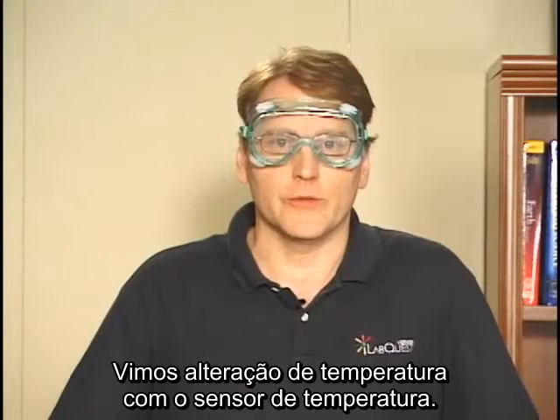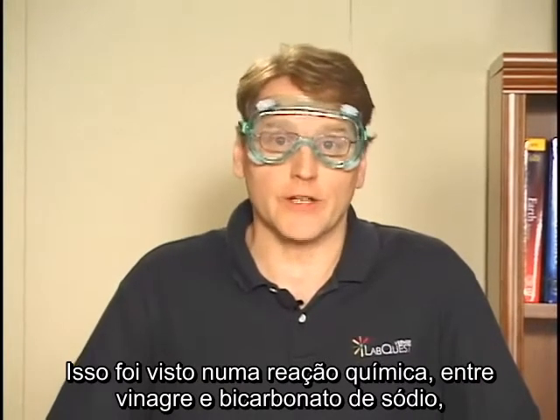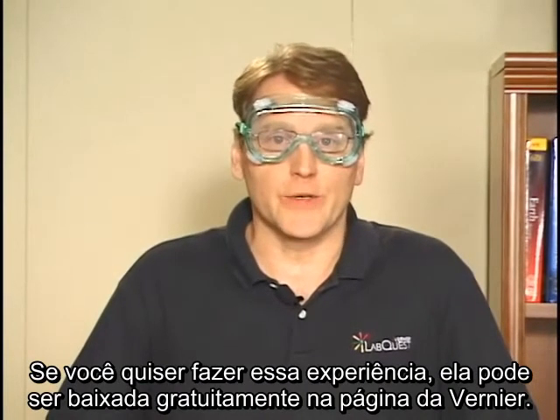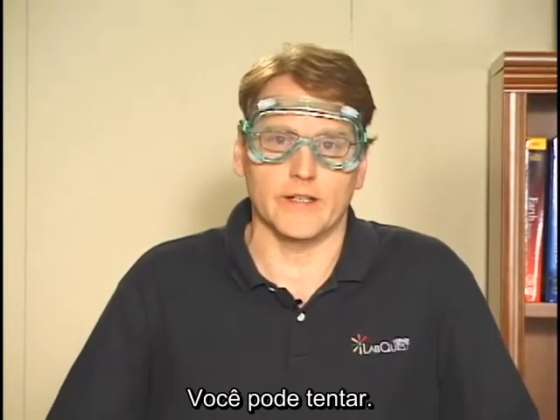Well, in this lab, we've covered some concepts that are kind of interesting. We have done some temperature change with the temperature sensor while doing a chemical reaction. So we had the vinegar and the baking soda, and as we added those two things together, we saw a temperature change. And if you're interested in doing this lab, you can download it for free from the Vernier website and give it a try.